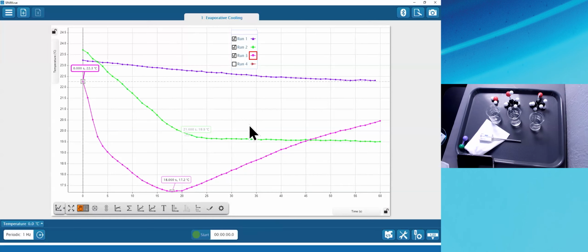Okay, now I said there was an easier, or rather, a less error-prone way to do slope. And many of the labs ask students to do slope. Before I do slope, I'm going to quickly show you other ways to select data besides the coordinate tool. Let's say I want to analyze just the sharpest part, or maybe just the first 5 seconds of every run. So I want to select just the first 5 seconds of each run.